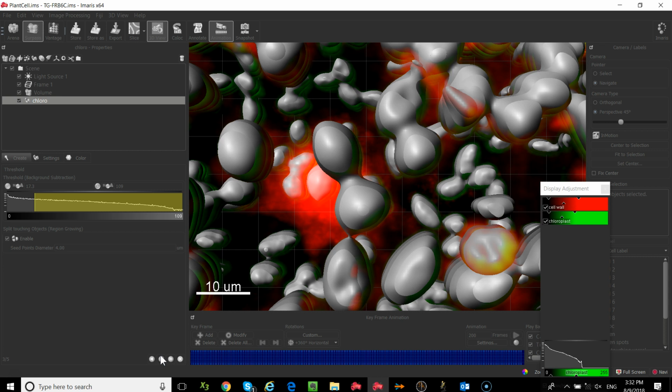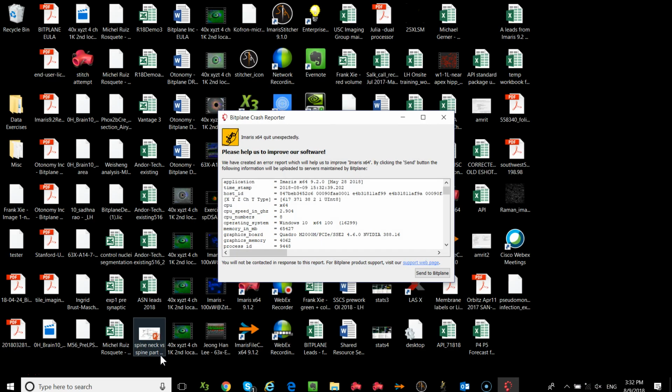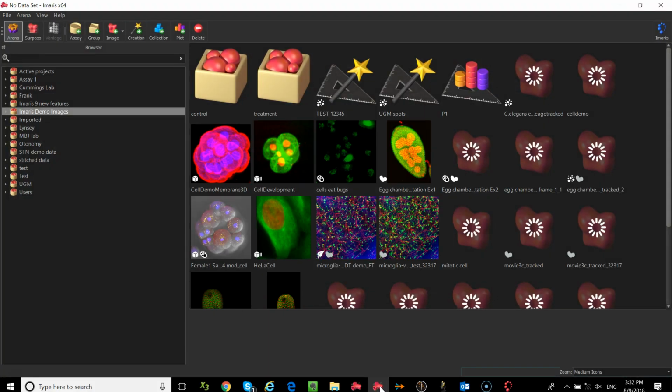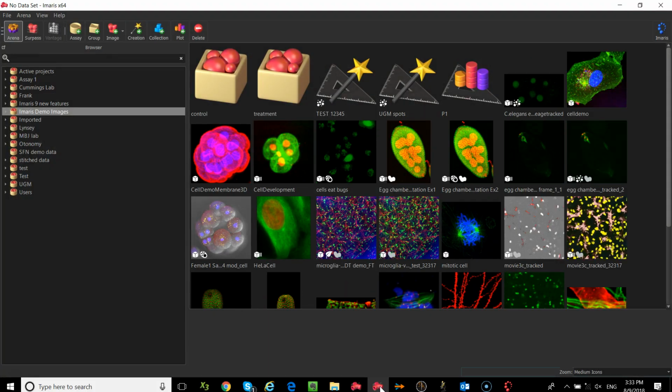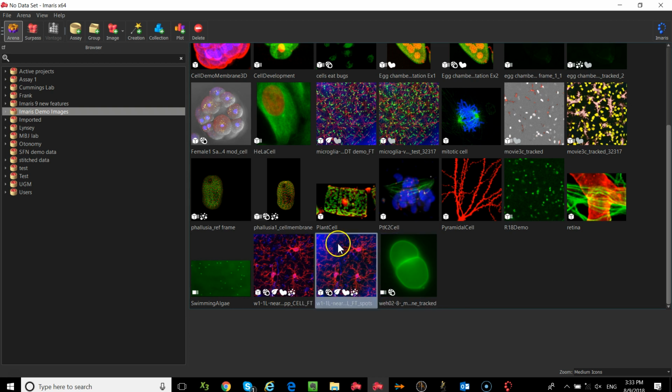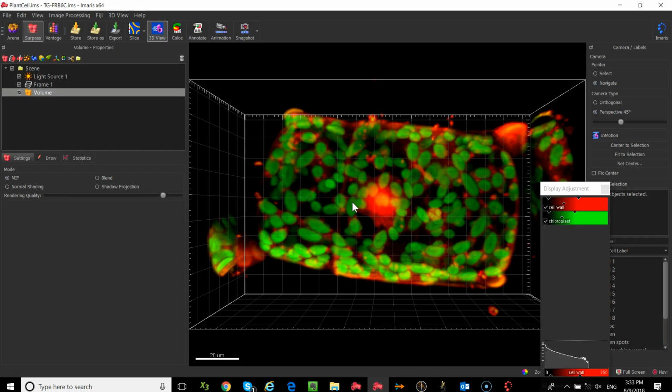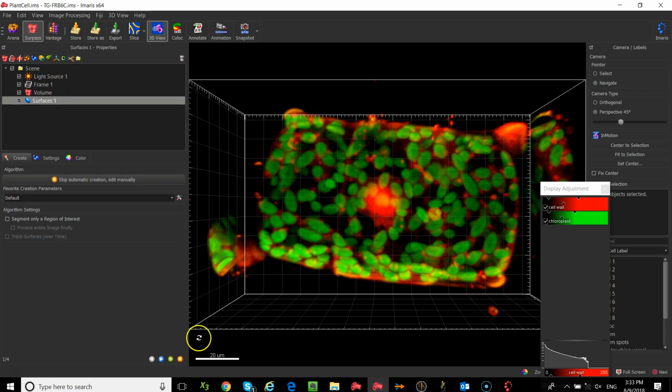And this is going to pull up a spot detection. Or not. Okay. This is where I'm going to give my laptop a break. It's been running all day with multiple applications, so I'm hoping it was just tired. So hopefully you guys didn't do what I just did. Are we good? No crashing? Yes. Okay. So let me get this back to where we were.